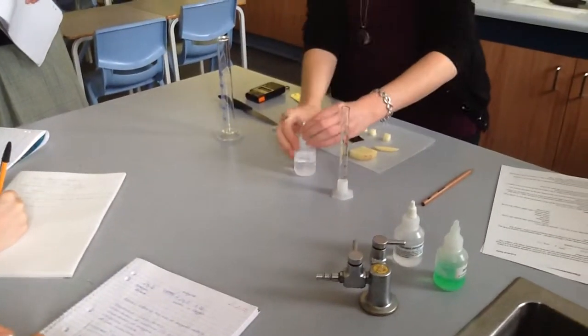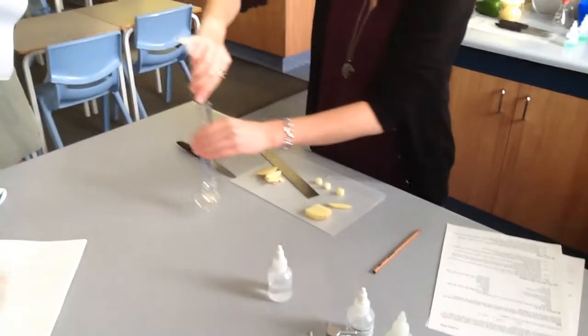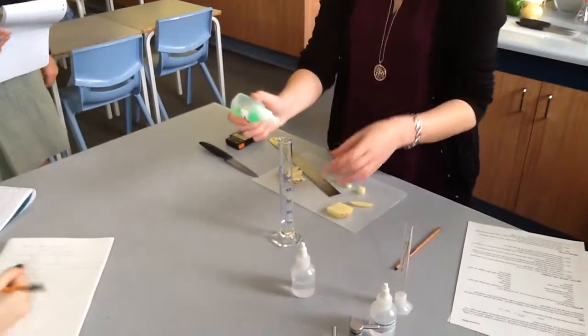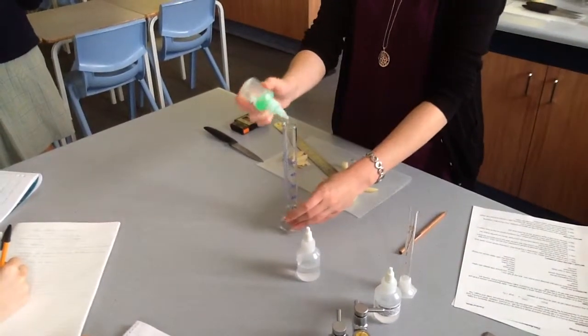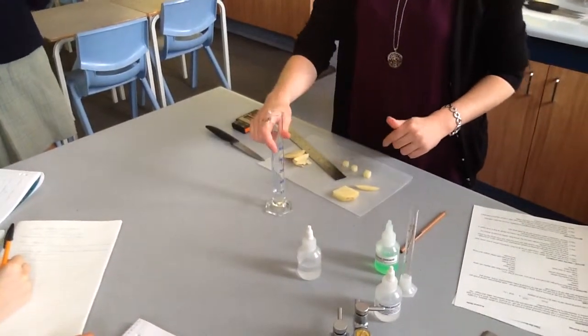Okay, so what I do is I get my hydrogen peroxide and measure the volume. I'm going to pour it into a larger measuring cylinder, and what I'm going to add is a couple of drops of detergent. There we go. So there's a couple of drops of detergent and I give it a swirl.